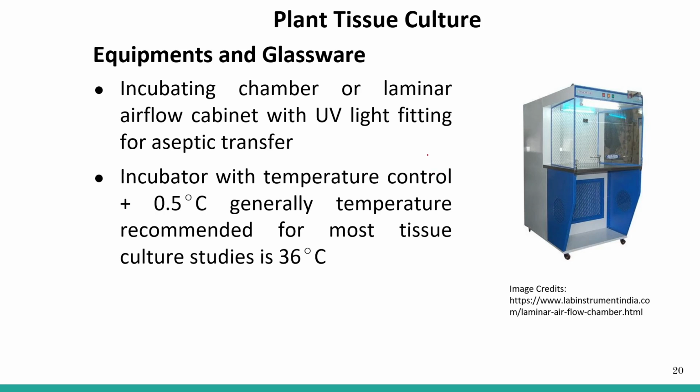Let us see what are the equipments we require. Equipments and glassware: incubating chamber or the laminar airflow cabinet with the UV light fitting for the aseptic transfer. So this incubating chamber or the laminar airflow cabinet is required. Here you can see, and it is also fitted with the UV light for aseptic transfer.